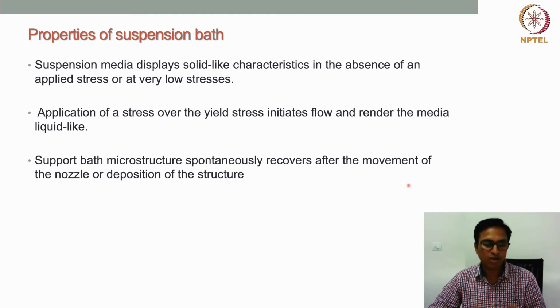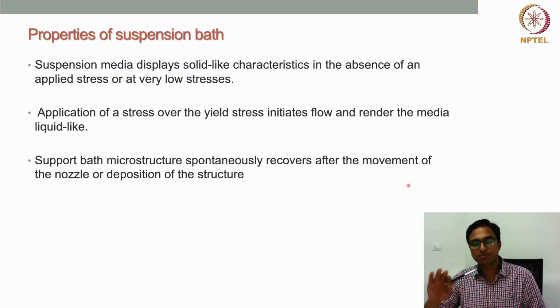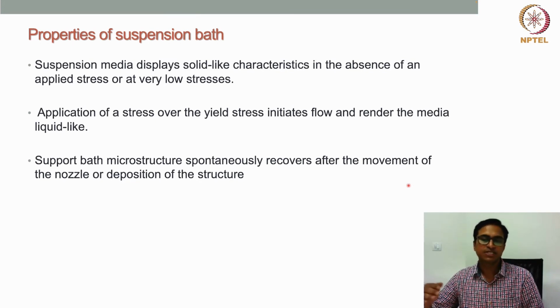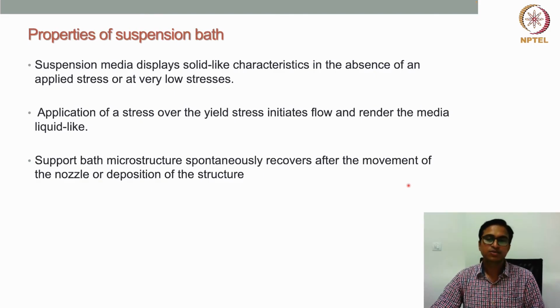So they display solid-like characteristics, and when the shear stress applied is above a critical yield shear stress, that is called yield stress, after that the support bath material starts yielding. That means it started to flow. So that's why any application of shear stress can render the material liquid-like.